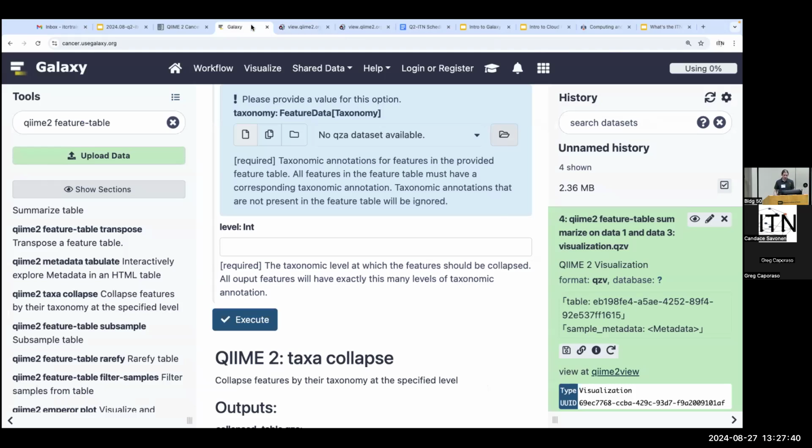Okay, thank you so much, Hannah. Okay, so the last thing I wanted to just mention today, so like this is, we gave a brief introduction to Galaxy and had you run through a first couple of commands there. And I think we all experienced kind of the issue that I mentioned earlier today, which is we're essentially using a shared compute resource for this.